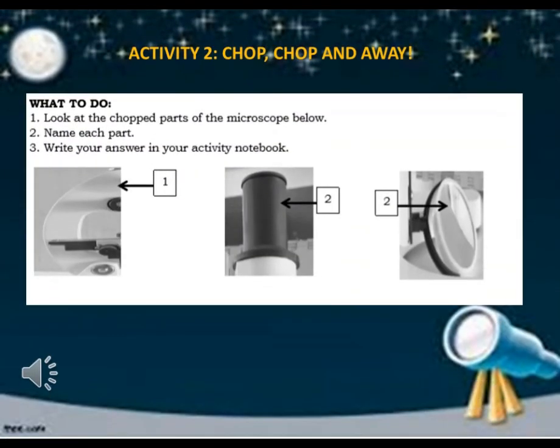As we discussed already the parts and functions of the microscope, the following slides will display the chopped part of the microscope. Therefore, let's do this. First, look at the chopped part of the microscope and name them on a piece of paper.